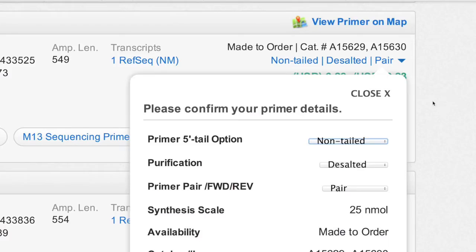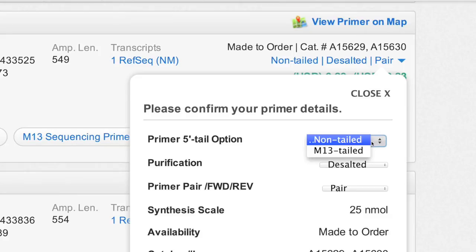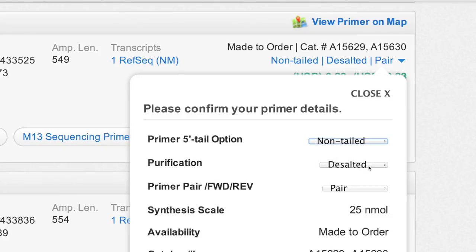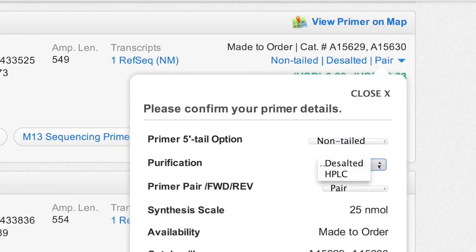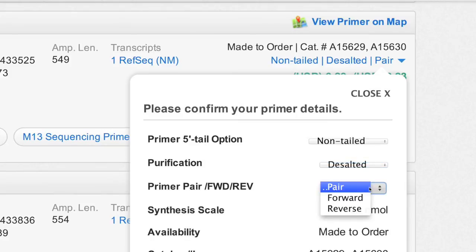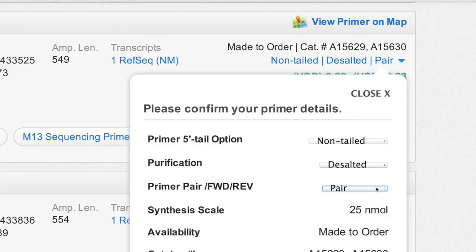Before placing your order, select the right primer configuration: with or without M13 tail, desalted or HPLC purified, and primer pair or only one primer. Note that if you order the primer pair, they will be delivered in two separate tubes.